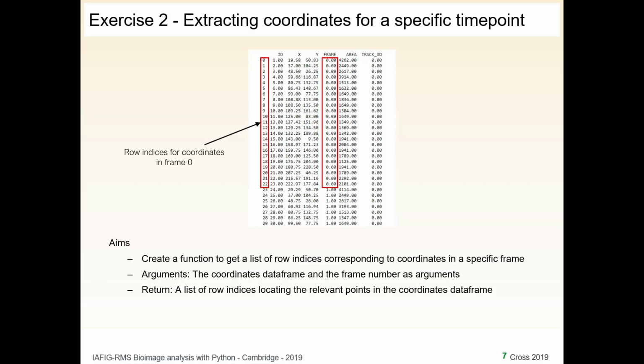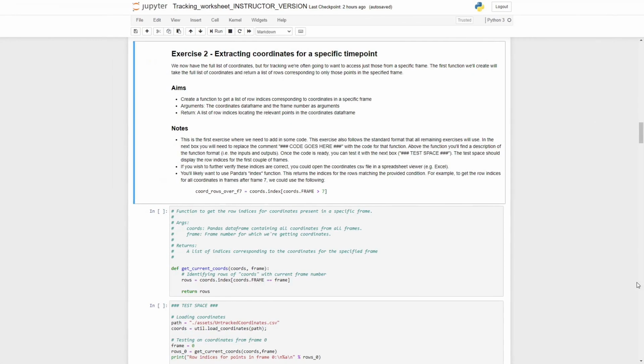Obviously now you can pause the video and just have a go at implementing this. Don't forget that you're welcome to look at the instructor version if you do get stuck, or you can obviously just unpause the video and see how I go about doing this. Okay, so let's have a look at one way of doing this.